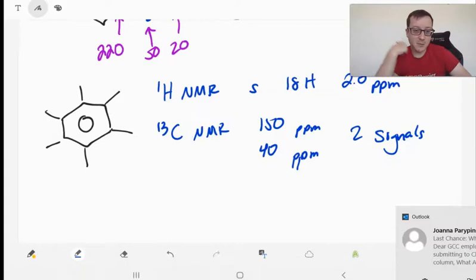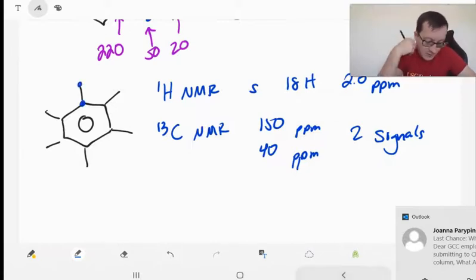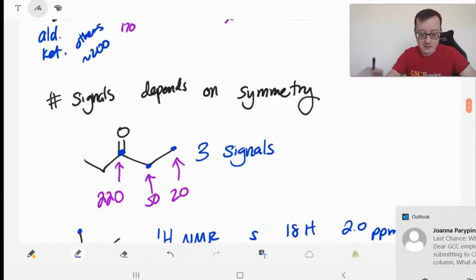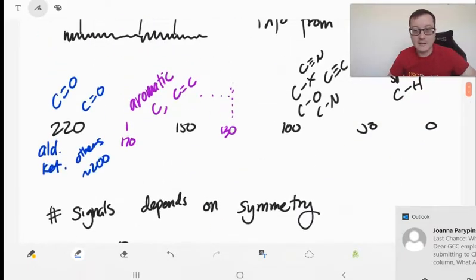And the symmetry works the same way. Chemically equivalent carbons will show up at the same place. So in this particular molecule, we have two different types of carbon, whereas we only have one type of hydrogen in this molecule. So just keep that in mind. It's a good supplement to proton NMR. So just a little bit of help. This is where you're going to see things, and it's a good kind of check for you. You say, I've got aromatic ones, or I've got vinyl ones. It's a good way to tell if you have that, even if you don't have hydrogens on those.